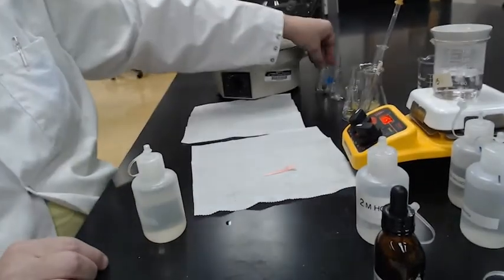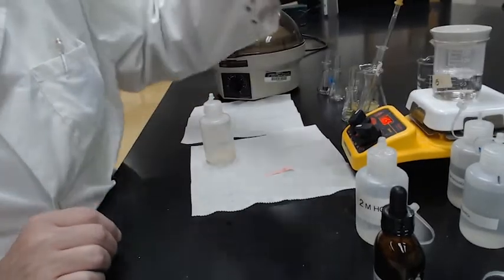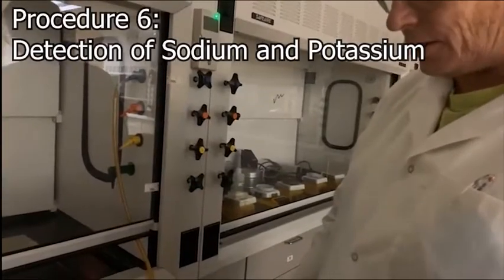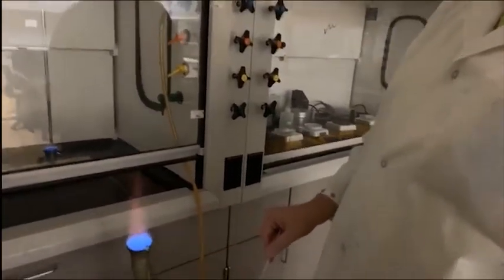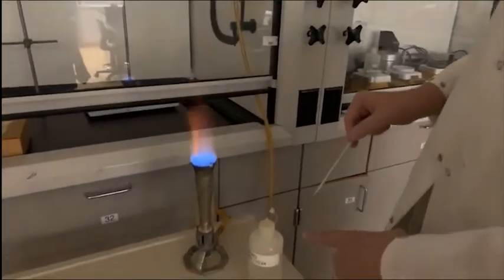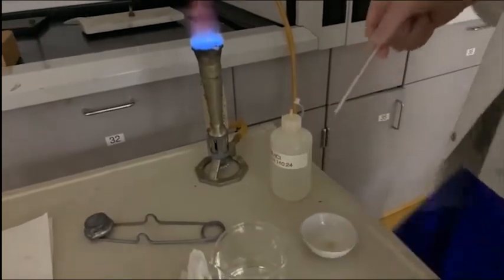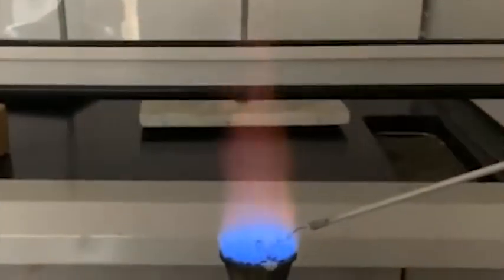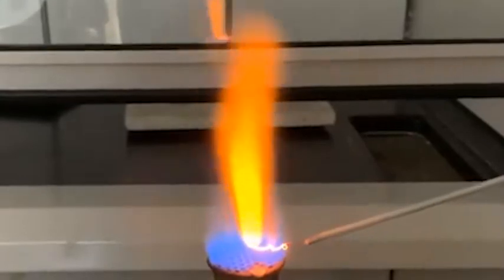We have one test left, and that is a flame test. This is the final flame test of the experiment. We either have sodium or potassium, we have to make a decision. We've already added the hydrochloric acid to redissolve whatever these salt crystals are. And we're going to do a quick flame without the lens to look for sodium, and then, hang on, we'll rinse off the lens.